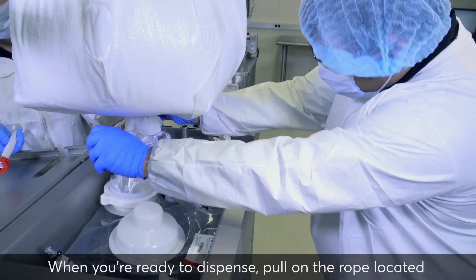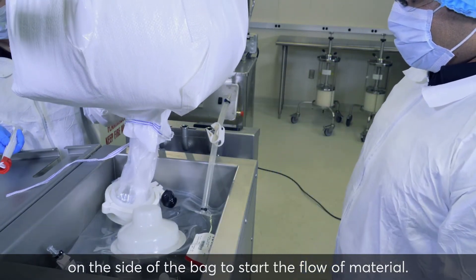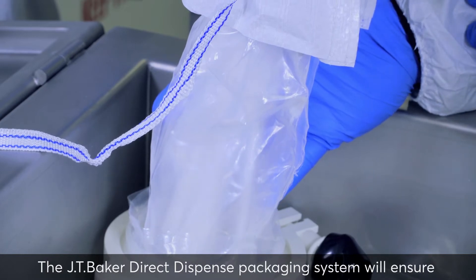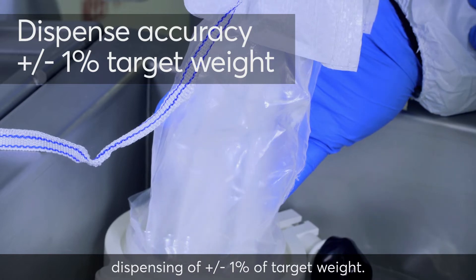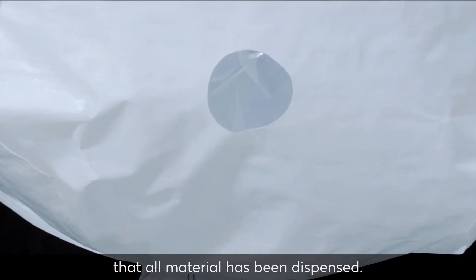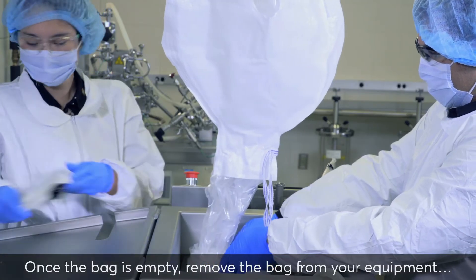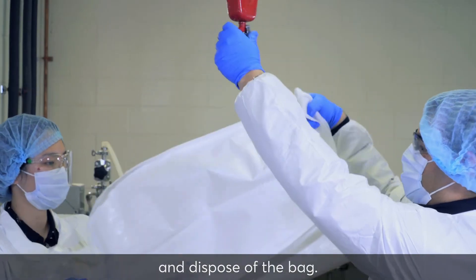When you're ready to dispense, pull on the rope located on the side of the bag to start the flow of material. The JT Baker Direct Dispense Packaging System will ensure dispensing of plus or minus 1% of target weight. Use the window on the side of the bag to verify that all material has been dispensed. Once the bag is empty, remove the bag from your equipment, close the receptacle, and dispose of the bag.